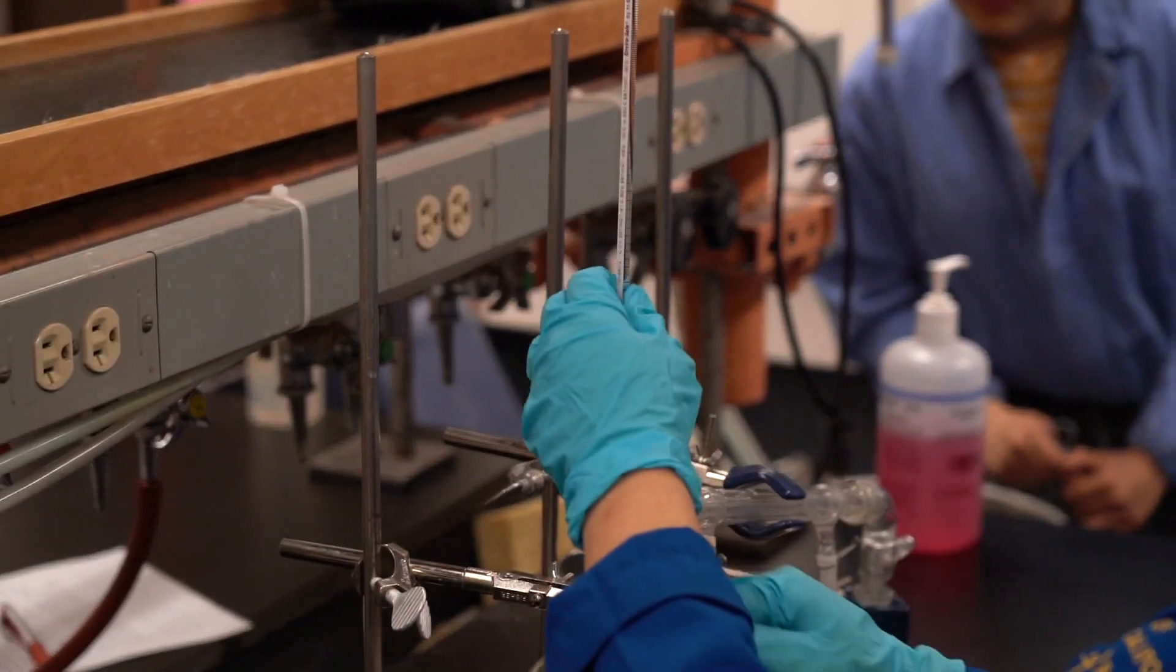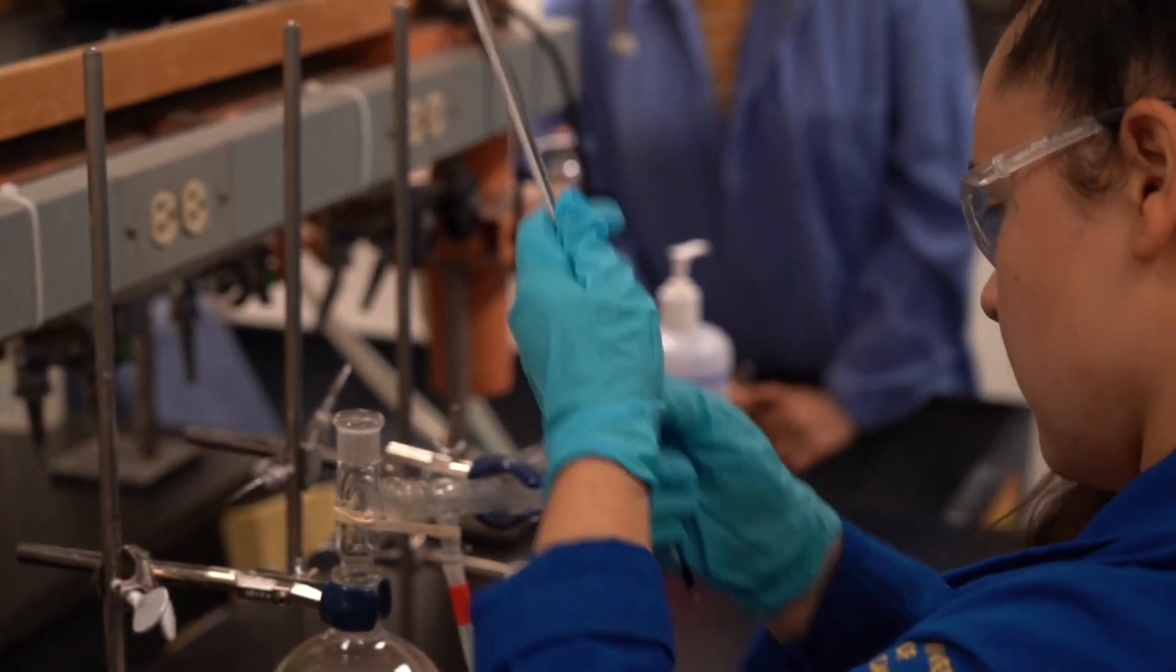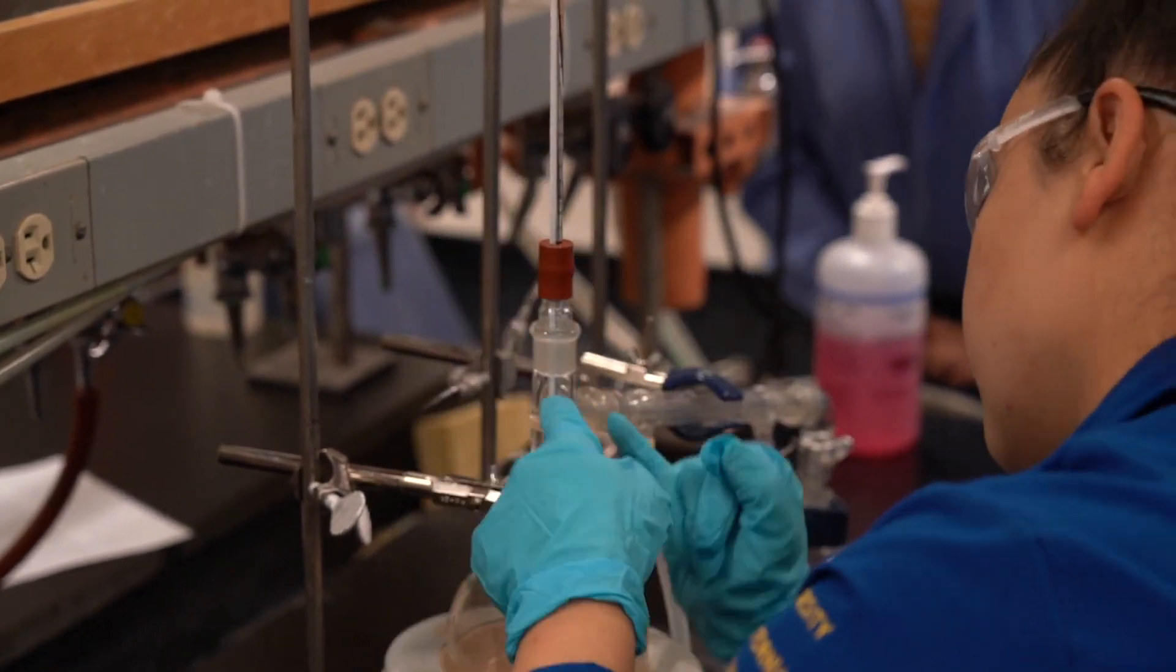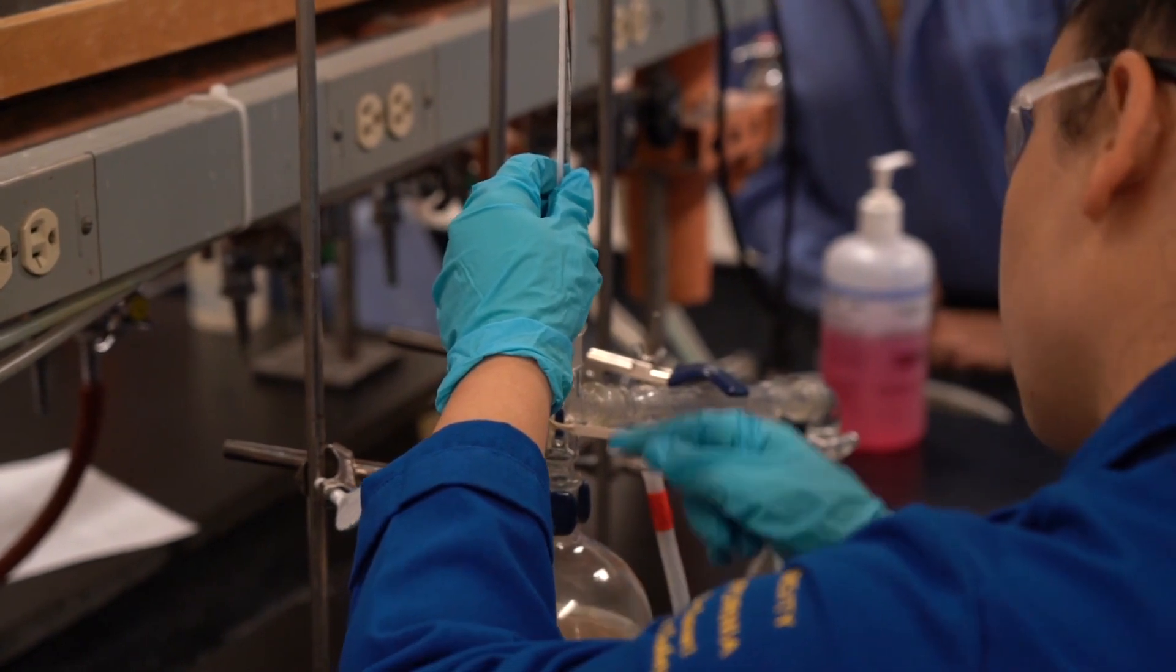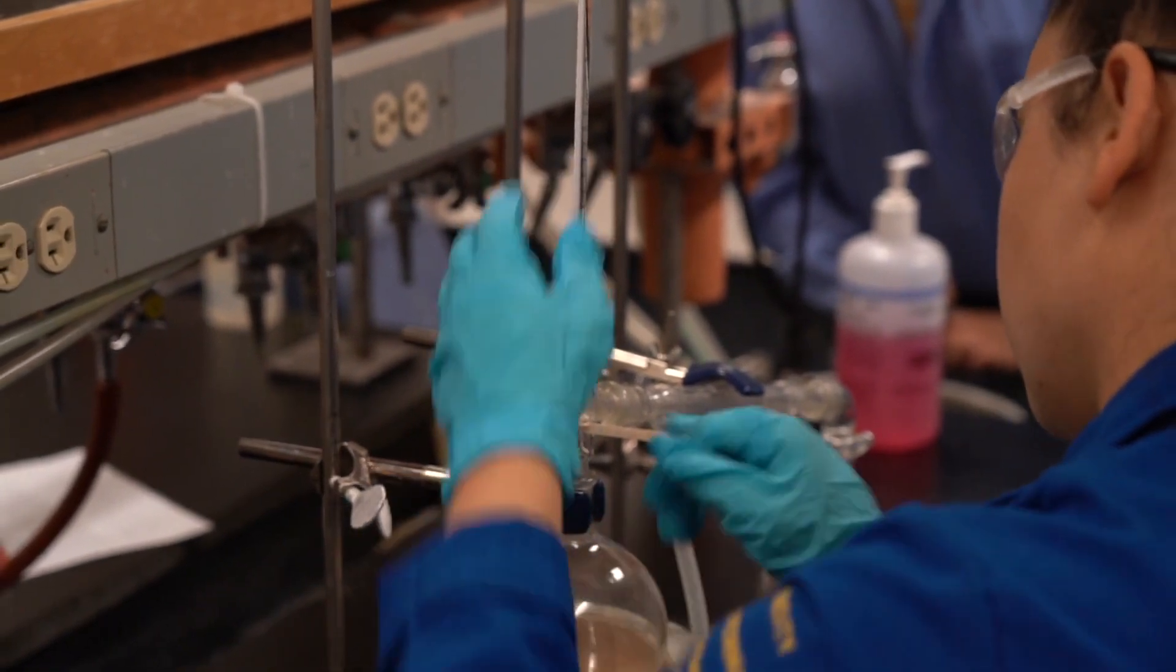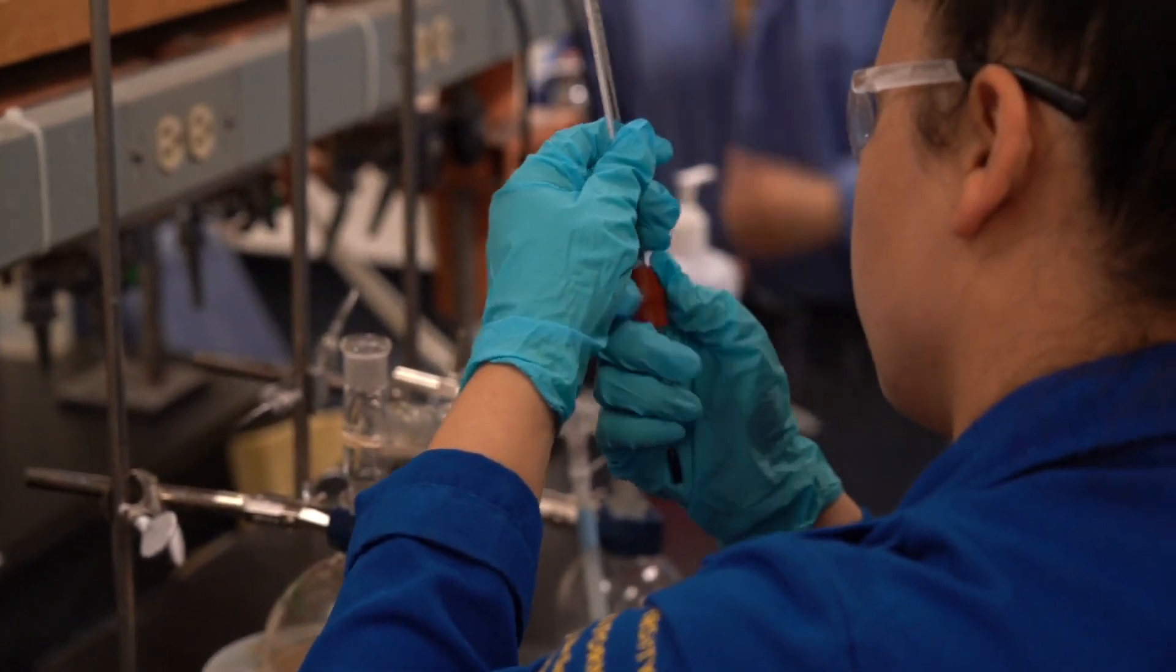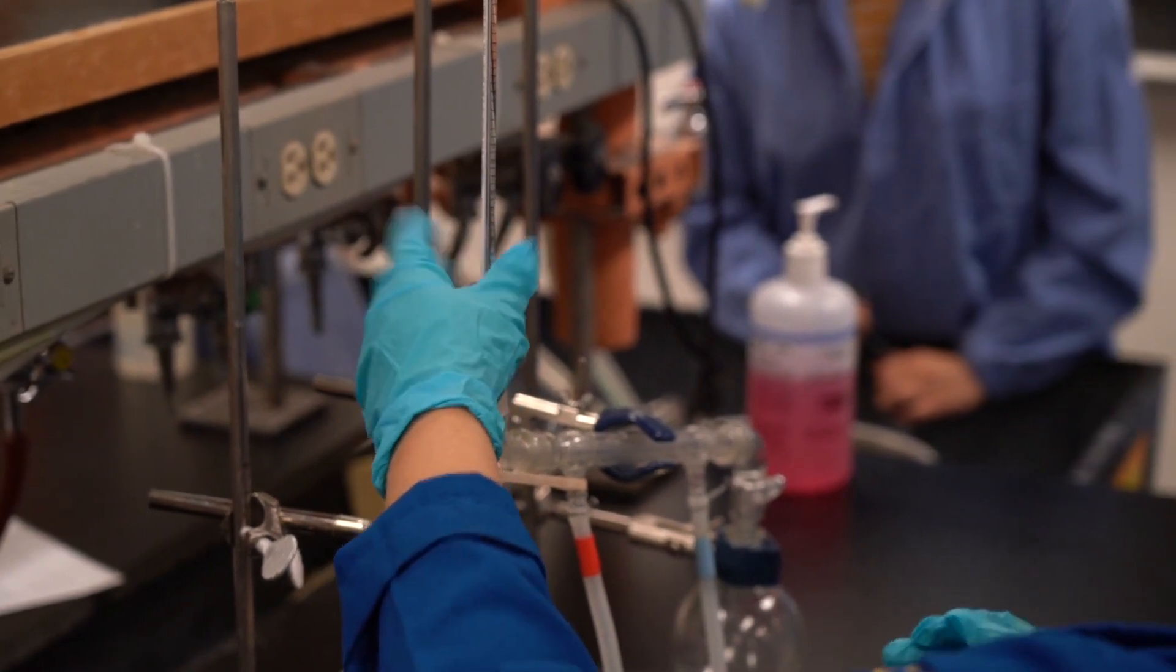So what I want is the thermometer tip, the blue bit, to be hovering right at this juncture. I would say right at the little T, because you don't want the temperature of the bath. You want the condenser. Like that. There you go.